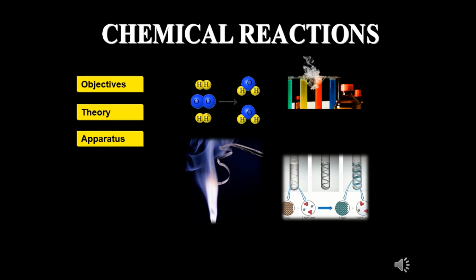practical session. Today, dear students, we are going to start experiment number 4, which is about chemical reactions. The title of the experiment is Chemical Reactions.